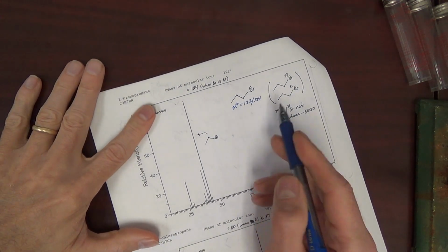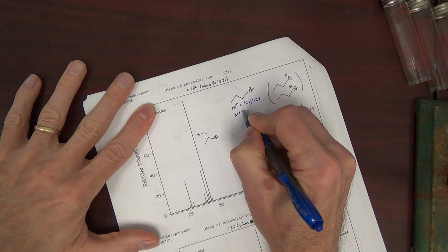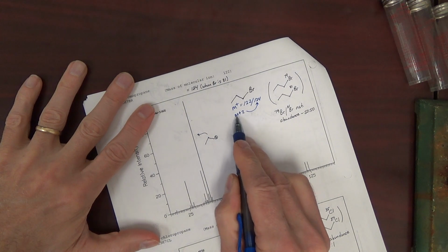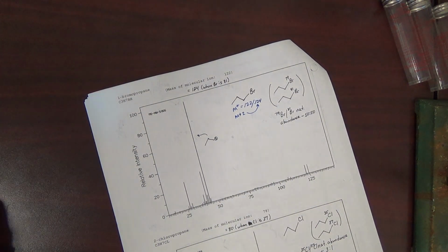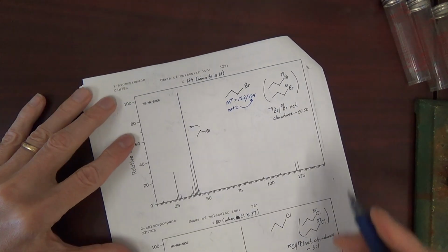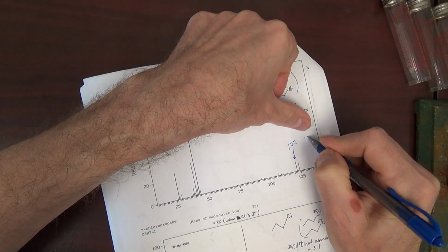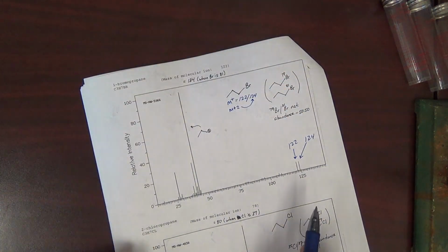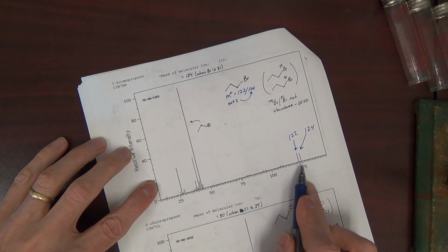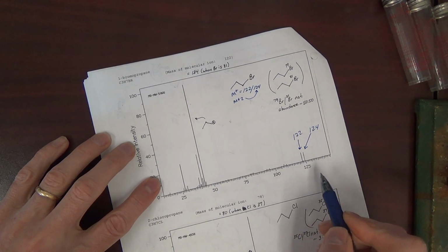Okay. A lot of times this is called M+, and the other is called M plus 2. Now this is where the plus is just a plus sign and the M is just molecule plus 2. Okay, this can undergo mass spec. Do we see 122 and 124? Yes, 122 and 124. So this sample contains both isotopes, and both molecular ions are showing up.